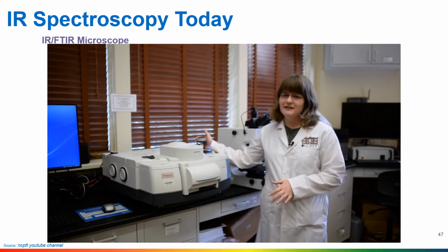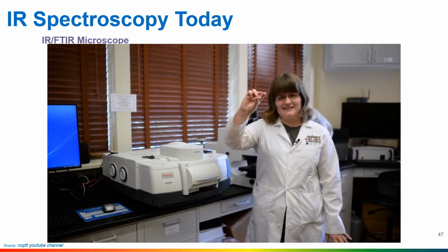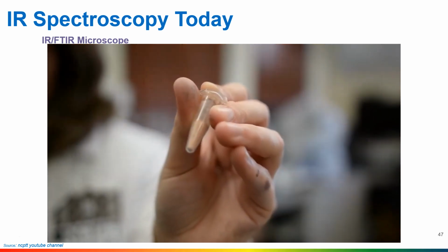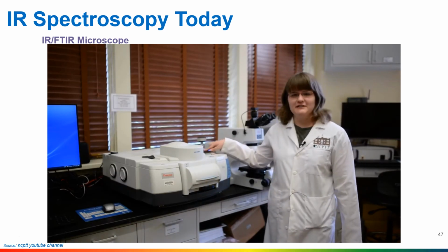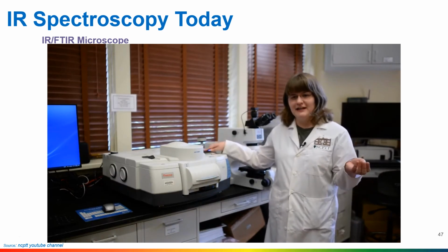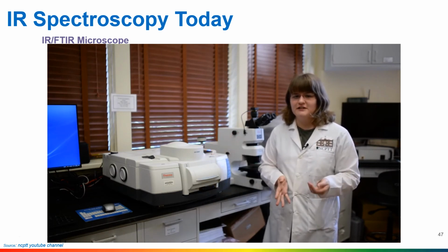If we use it with solids, it's typically a destructive test because it requires us to powderize the sample, like you can see I've done here. So the liquid or solid is placed onto a crystal, which we have here. A beam of infrared light is passed upwards. It interacts with this material, and this interaction produces a spectrum of the absorption of that light.